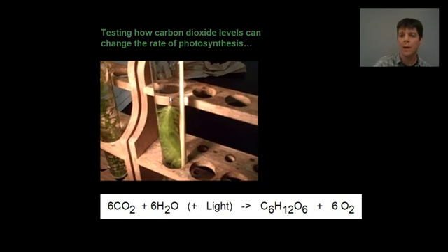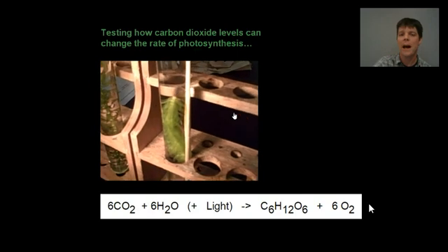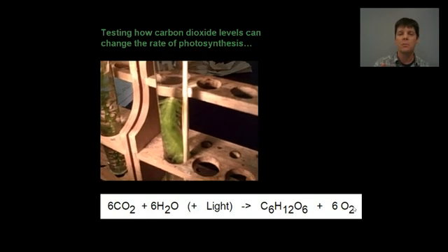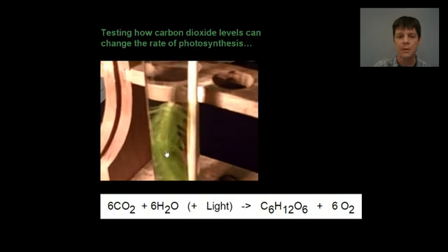Here's a video of another plant. Same experiment. Here, we can see that there are a lot of little tiny bubbles that are leaving from this plant. These are bubbles of oxygen that are produced by the photosynthesis process.